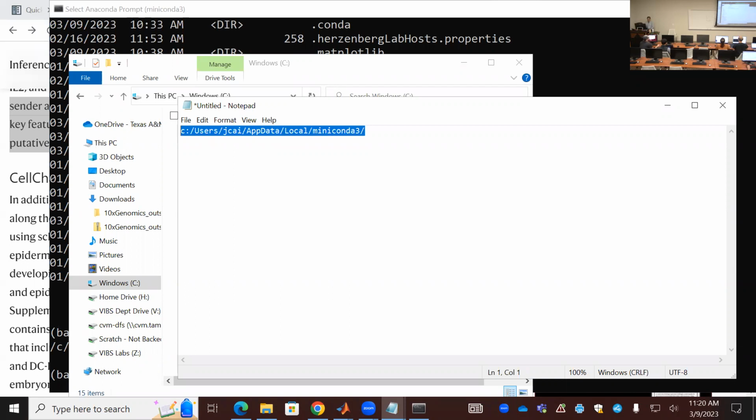Yeah, so the Python should be located in this folder. So it depends on your username.